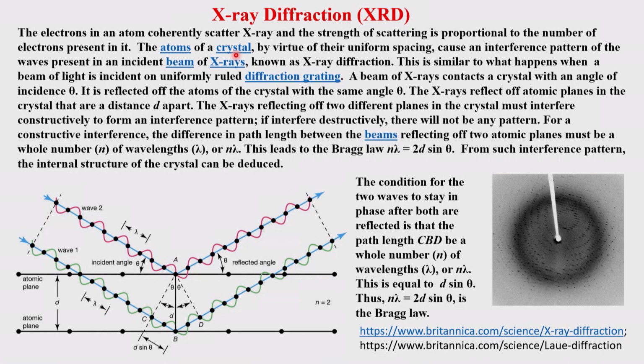Individual atoms, each atom, act like a scatterer. Now, is every atom a scatterer of equal strength? Absolutely not, because the scattering strength depends upon the electron density. So, from one atom to another atom, the electron density is absolutely different, therefore you have different scattering strengths. Now the next point we have looked at is the overlap of all this, the interference.